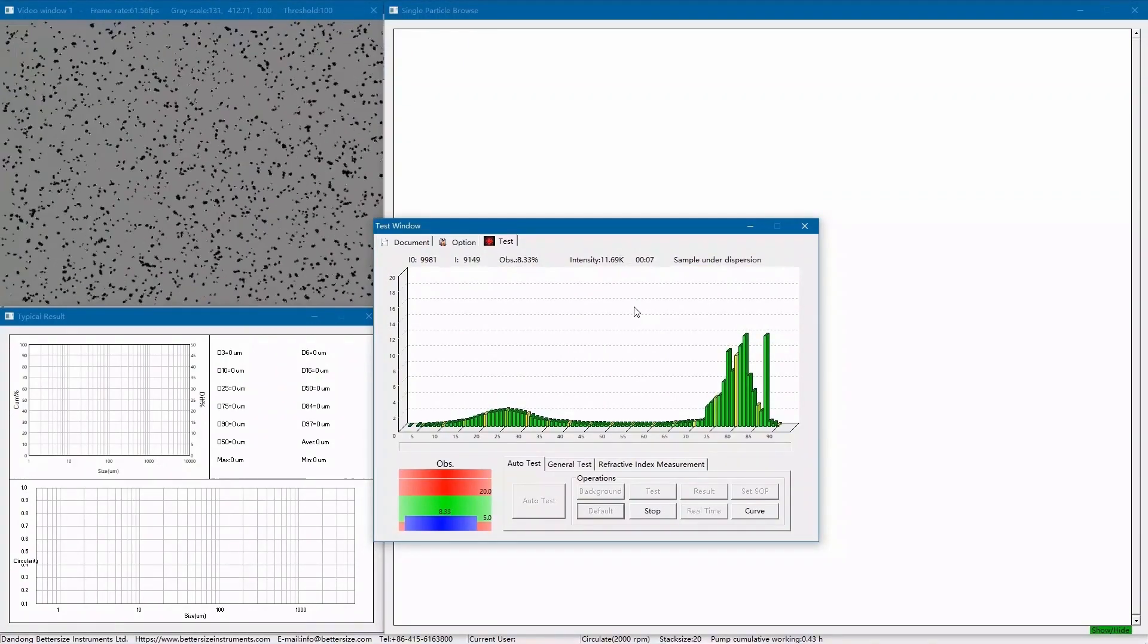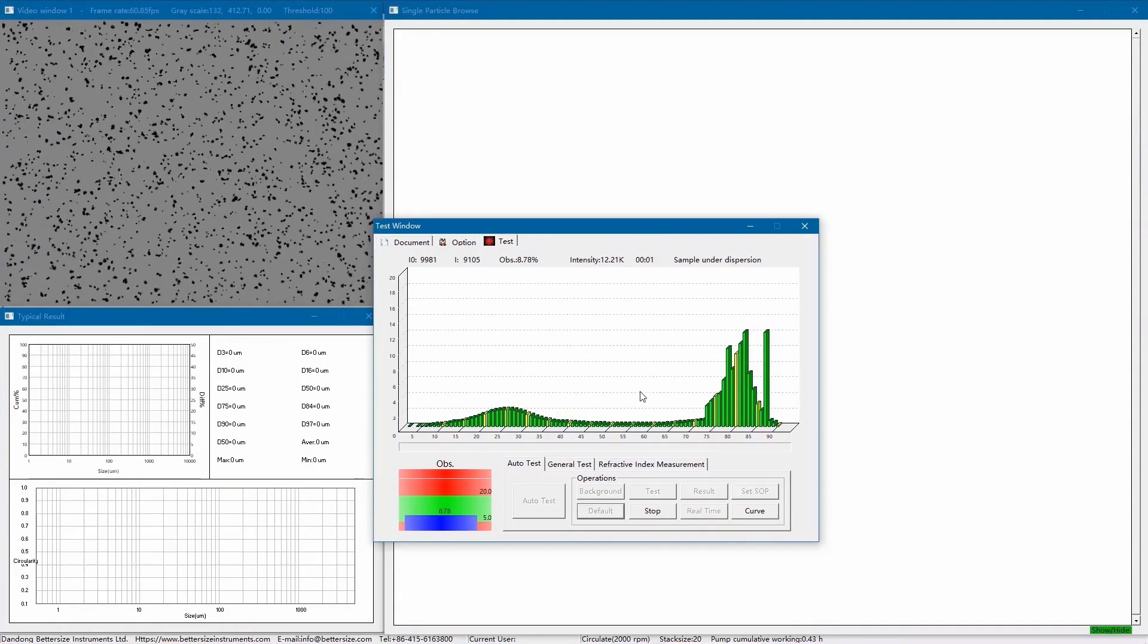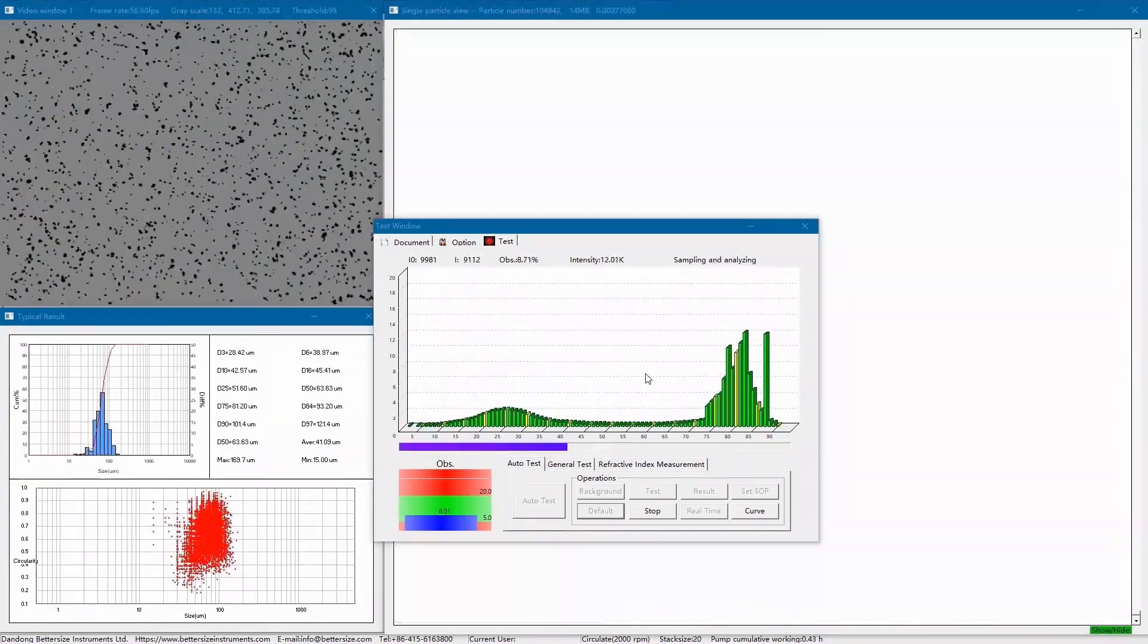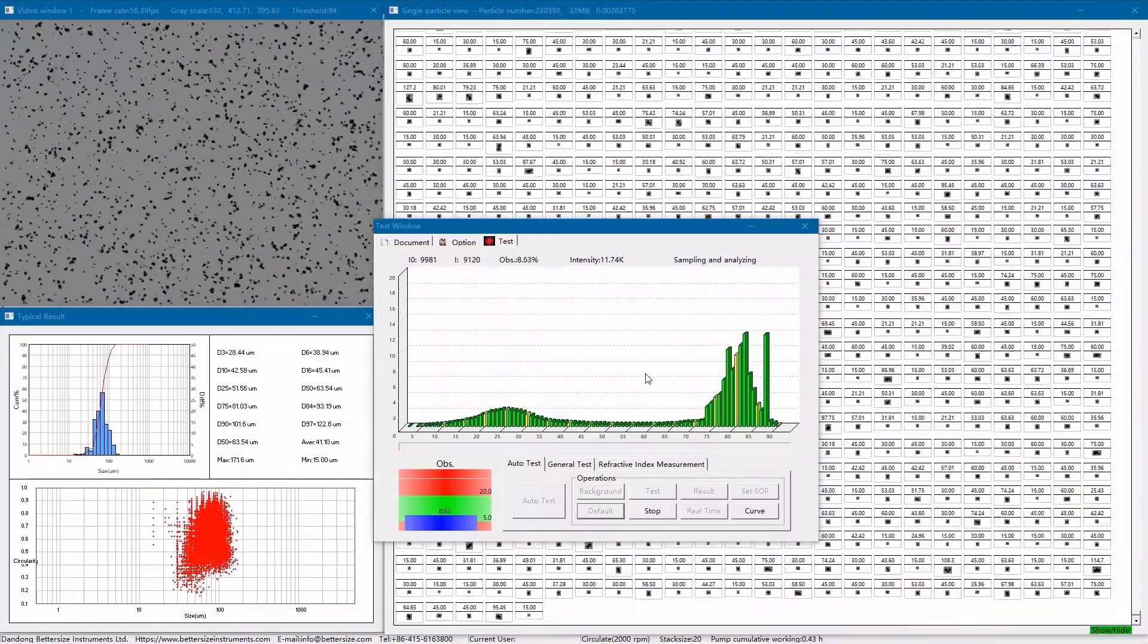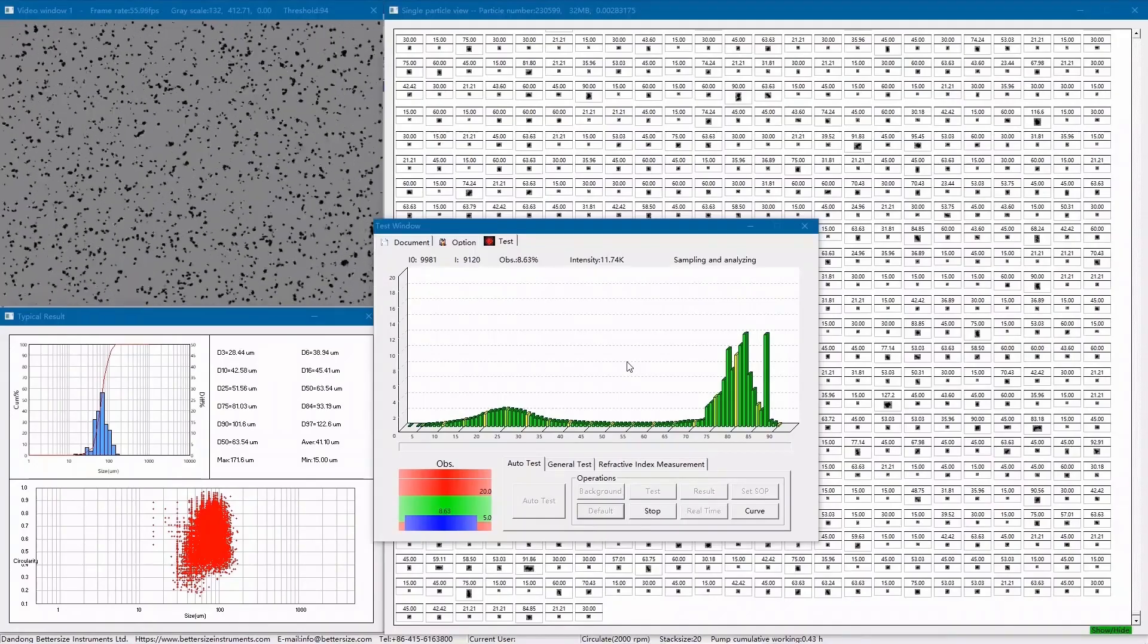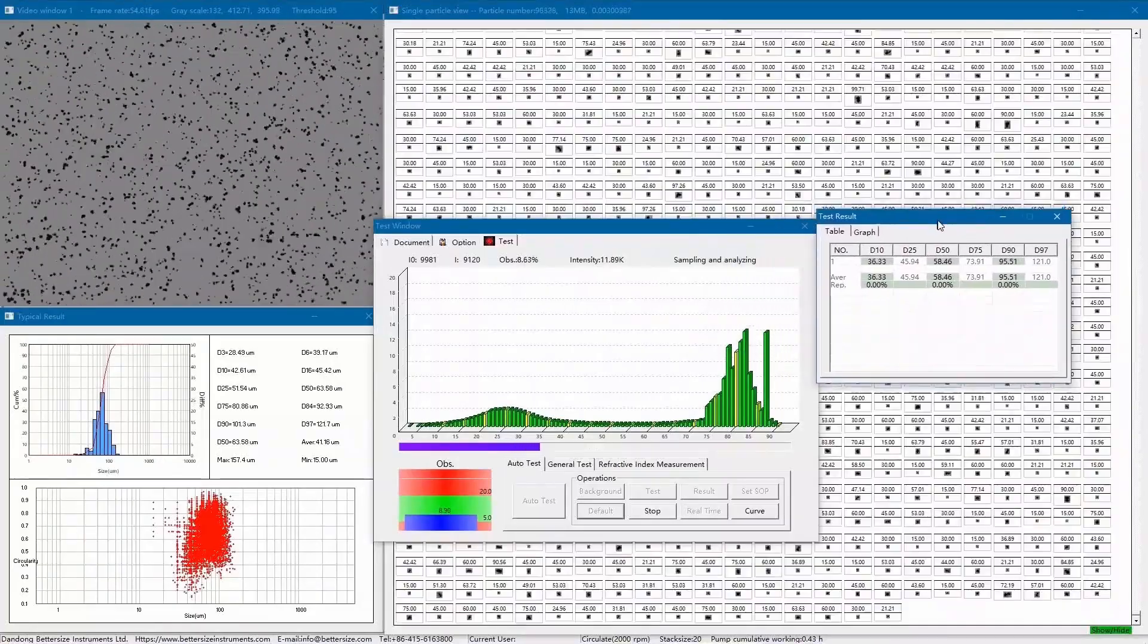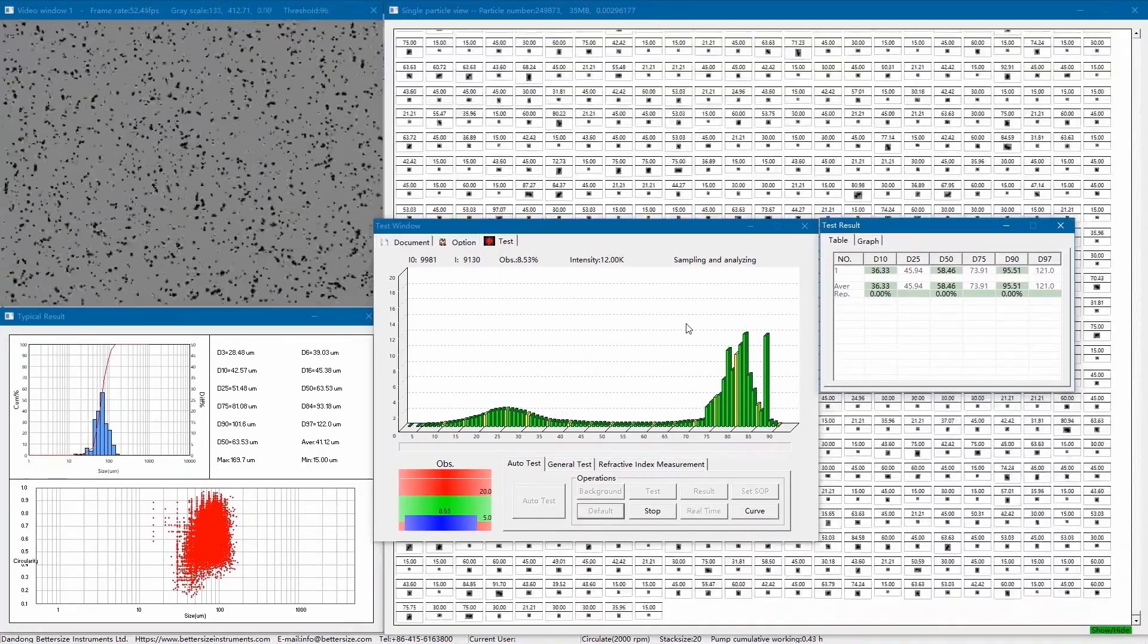Let me go over these windows in brief during the dispersion process. Firstly, the test window belongs to the laser diffraction system of the Betasizer F3+. Using the Betasizer dual lens and oblique incidence optical system, the Betasizer F3+ has extremely high accuracy for very small particles. Our patented technology provides for the focusing and collection of the backscattering signals at a very wide angle range from 0.02 to 165 degrees, ensuring excellent detector resolution compared to other systems available in the market.